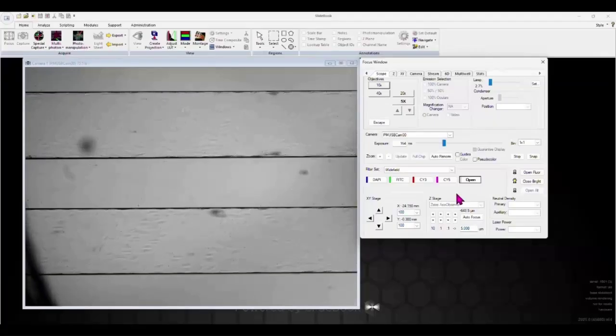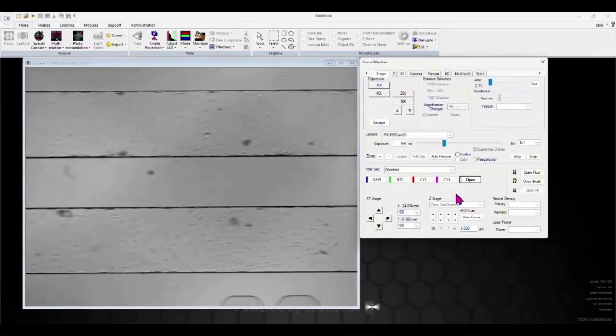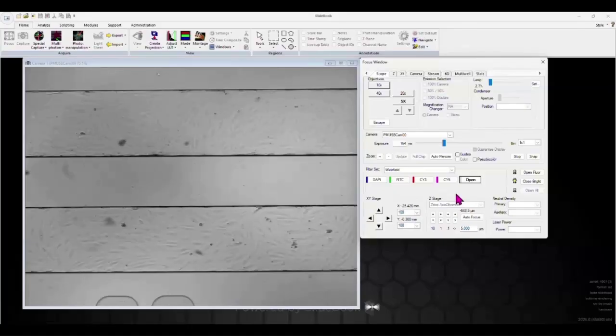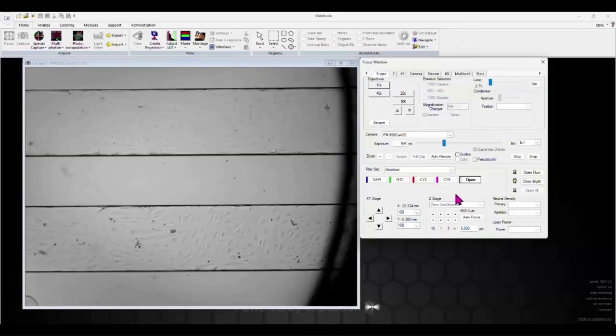Each microfluidic flow cell was loaded with 50 microliters of a cell suspension with a concentration of 10 million cells per ml. To seed a full plate, you typically need 10 to 20 million cells per ml. If confluency isn't reached overnight, you can feed the cells every day with fresh media until they reach the desired confluency. In this experiment, we're comparing two conditions.